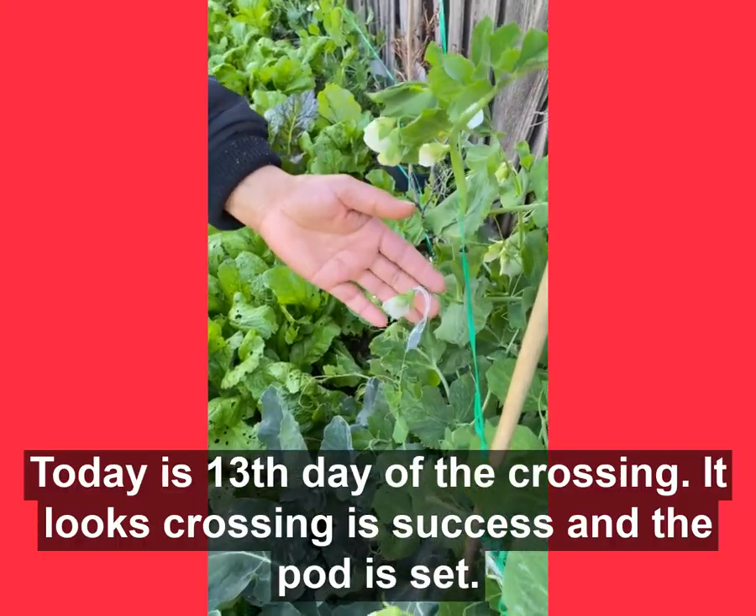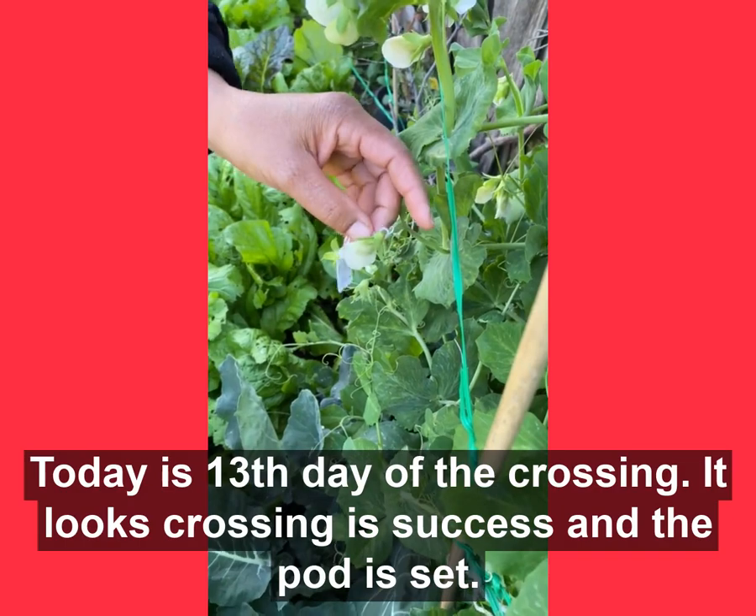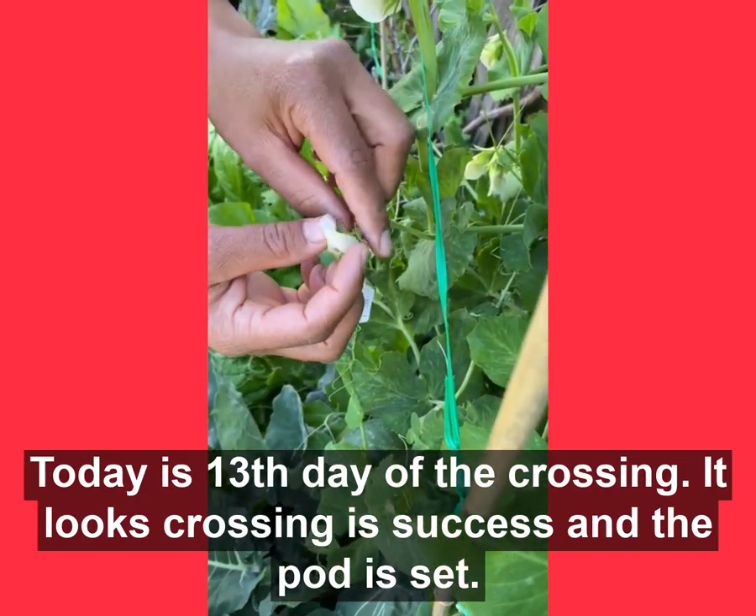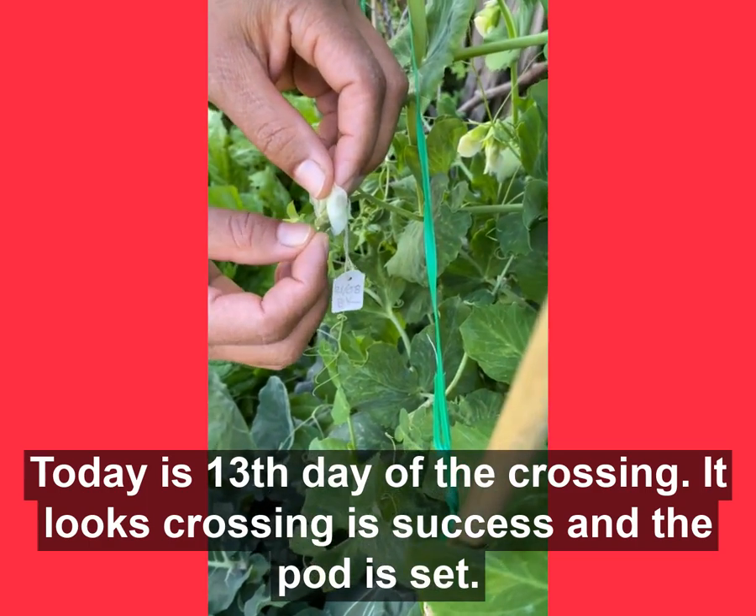Today is the 13th day of my crossing, so it looks like the crossing is a success — the pod is set.